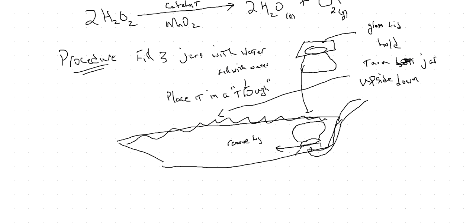Now, what is this tube connected to? It's a tube that goes to the bottom and feeds into the bar. So this tube goes down here, and there's a hole that this goes through, and then we place the bottle over this hole.